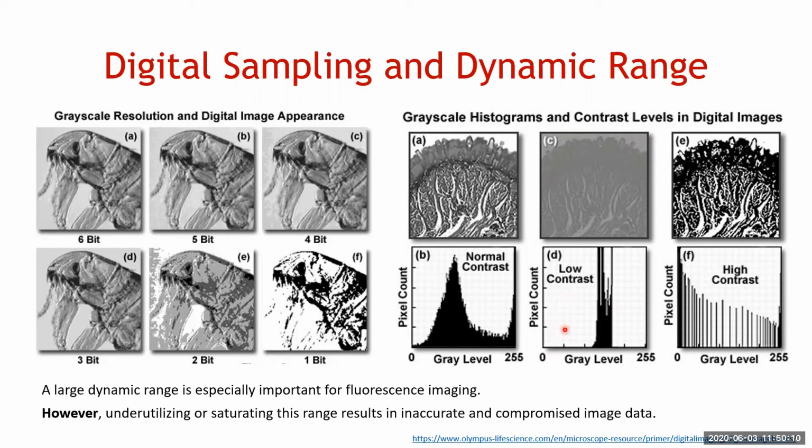And what that means is that you're just underutilizing the range that's given to you. And you end up with something like this, especially when you play with image analysis and you try and play with a threshold. All of a sudden, your background is pretty much the same as your feature or your target, and then you're in trouble.